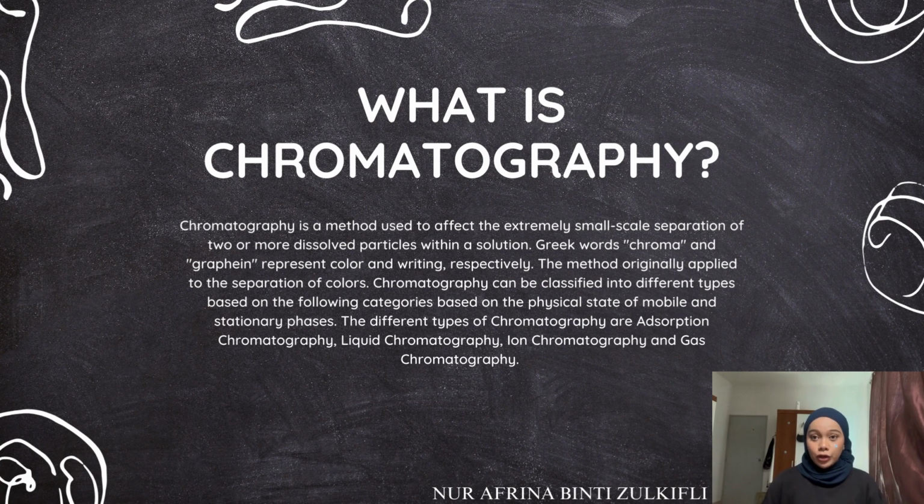What is chromatography? Chromatography is a method used to effect extremely small-scale separations of two or more dissolved particles within a solution. The Greek words chroma and graphein represent color and writing, respectively. The method was originally applied to the separation of colors.